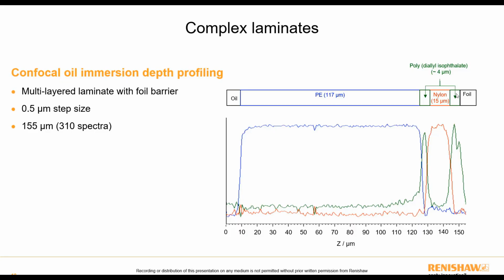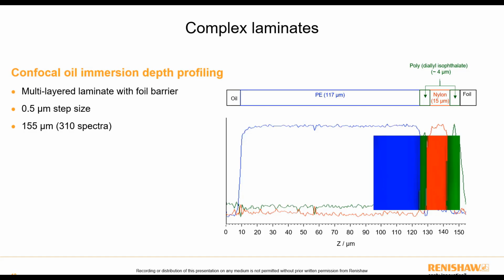So doing this for a single point, that's fine. That gives us this really useful information. But of course, we can do more than that. We can look at how it varies, not just in depth down through the x-axis here, but also how we can look laterally to that and look at effectively multiple depths at the same time.